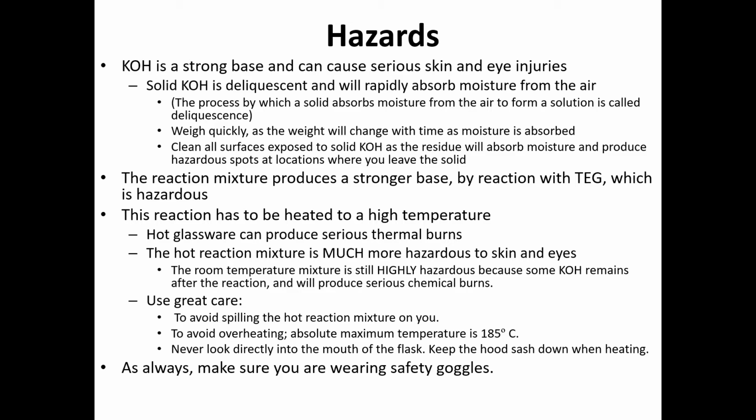And what's even worse is that this reaction mixture, when it's hot, is much more hazardous to the skin and to the eyes. So it's imperative that you be as careful as possible when you're working with this reaction. So just always be careful, avoid any spillage if possible, and avoid overheating because we don't want it to boil. And again, always protect your eyes by wearing those safety goggles.